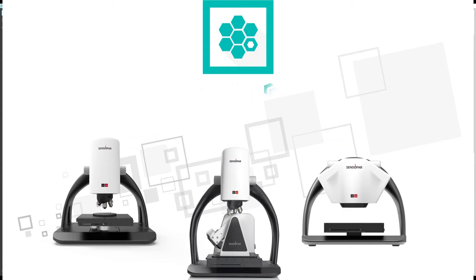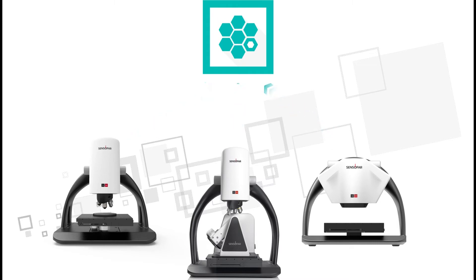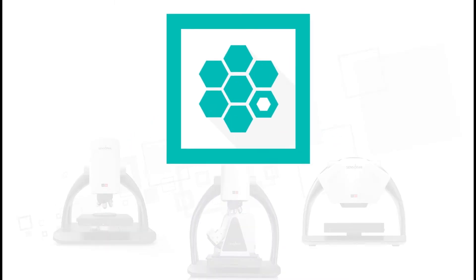The analysis of Senso Pro can actually be linked to our 3D microscopes to achieve the full automatization of the characterization.